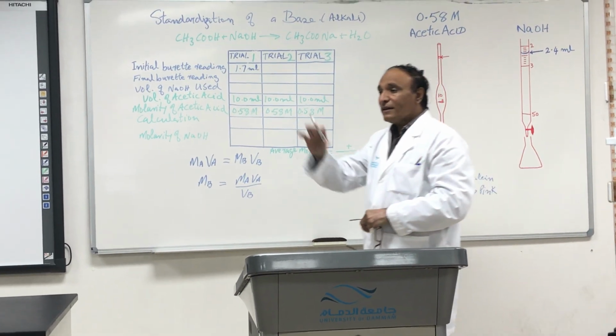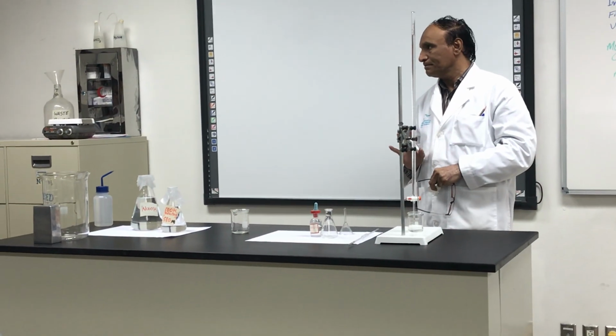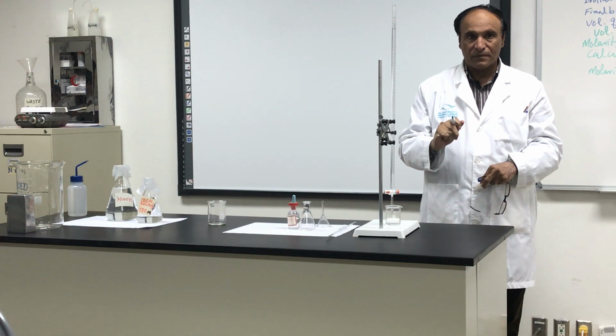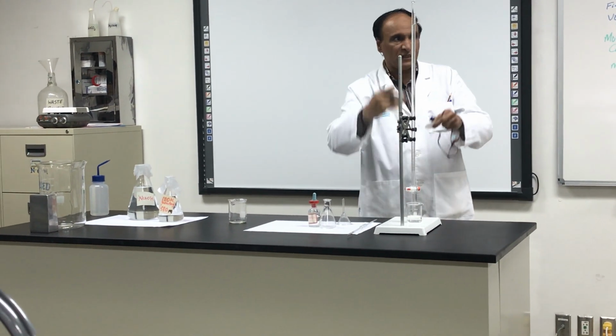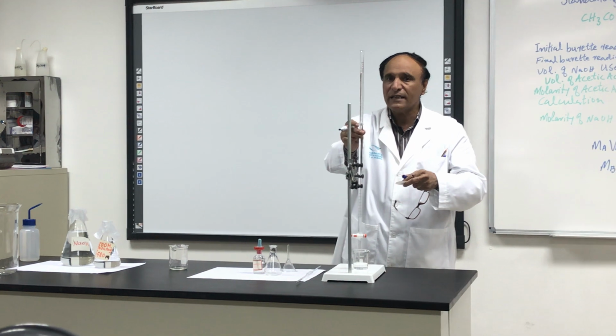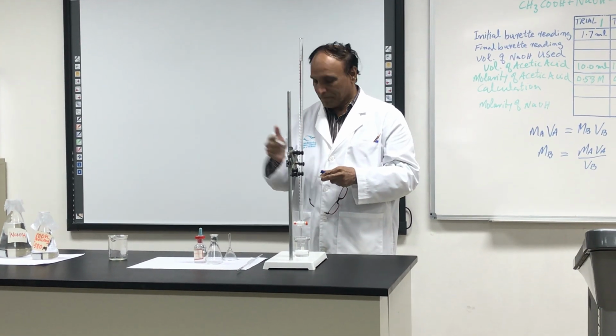Yes. All this work which I have done, one student will do. What will the other student do at the same time? He will not look at what the first student is doing. He will do his own job. This is the job of one student who has made this ready. Did you understand? Okay.